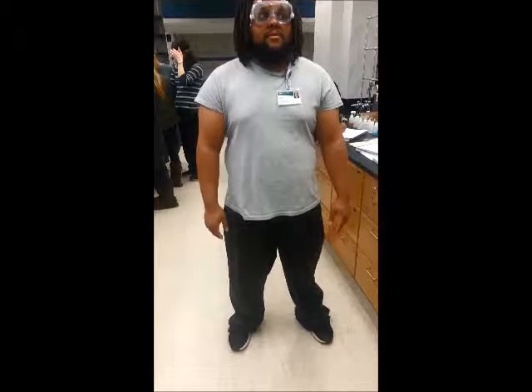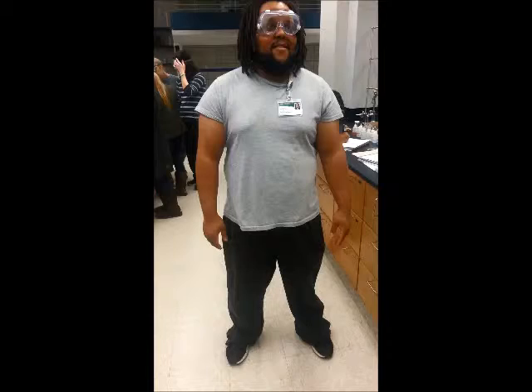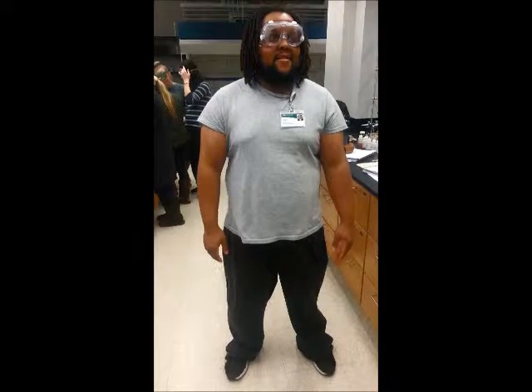Before starting any lab, review your safety procedures. Make sure you have your goggles on at all times. As for clothing, make sure you have pants, closed-toed shoes, and a shirt that is no shorter than short sleeve.